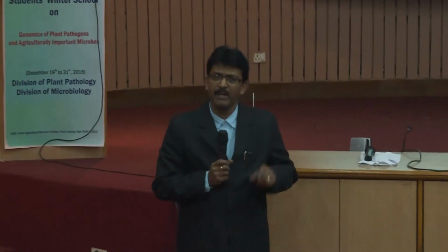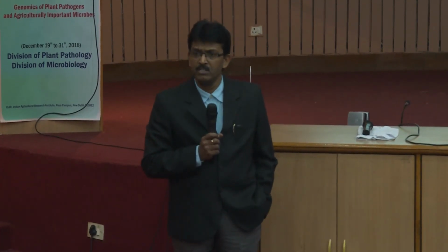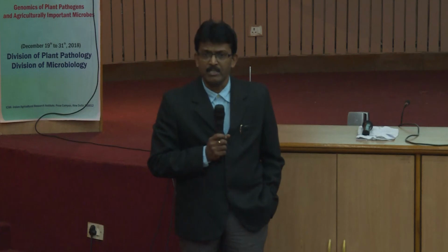Now you go back to the lab and do this practical on absolute quantitation. Once the reaction is set up, we will start another very small practical on the data analysis of relative quantitation real-time PCR.